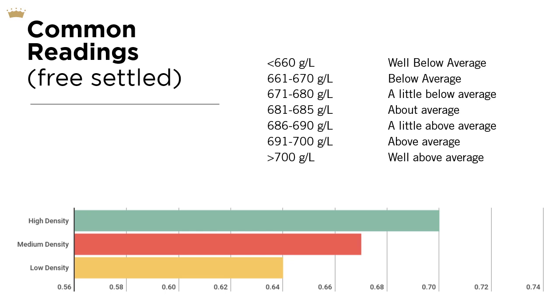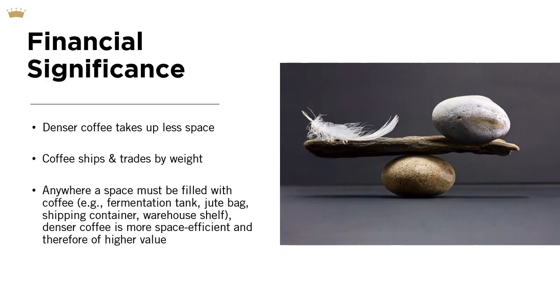The moisture meter actually is calibrated to the ISO standards and spits out a figure that's in most cases very close to what we're measuring by hand in the lab. It's not hard to infer from the sorting techniques employed post-harvest that a coffee's density matters.